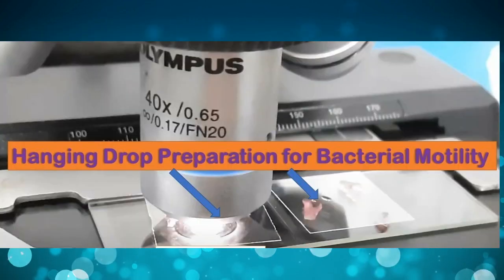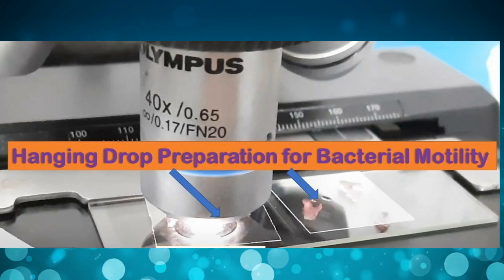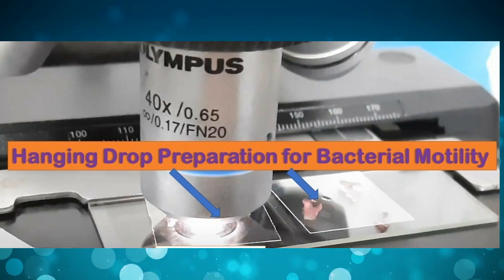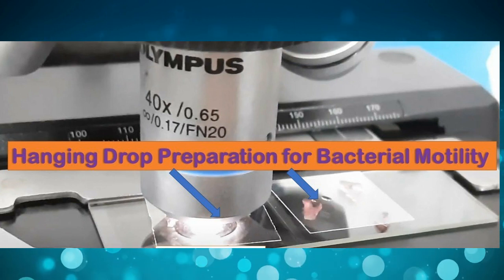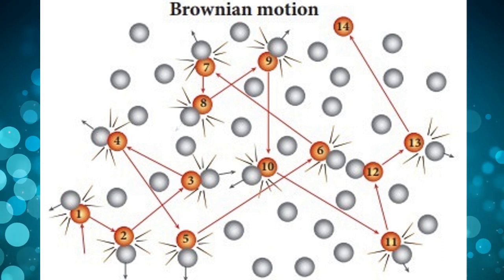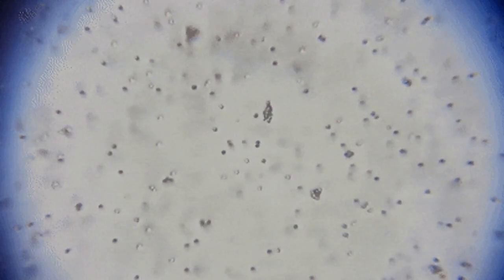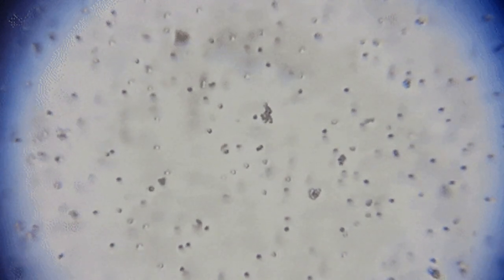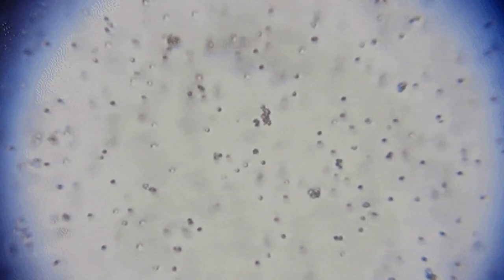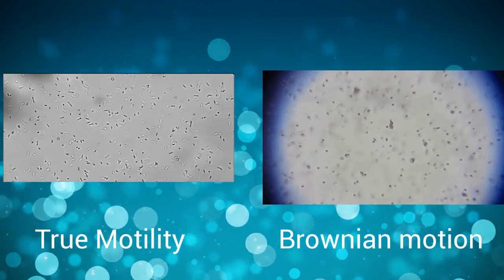Once we can see the edge of the hanging drop, we shift the objective lens to 40x and observe the presence or absence of bacterial motility. The particles in the suspension have a natural motion called Brownian motion. This gives a false impression of motility. So we should be able to differentiate between the true motility versus the Brownian motion.